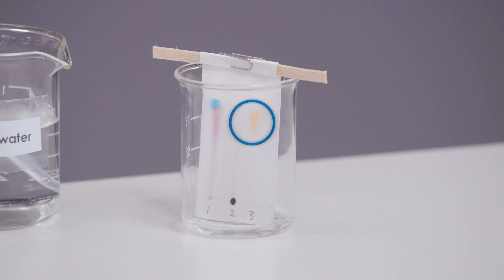Sample three shows that the orange ink is pure. We know this because it only has one spot of colour on the chromatogram.